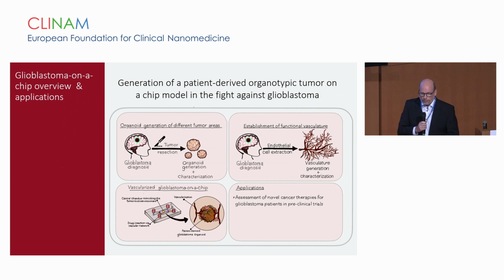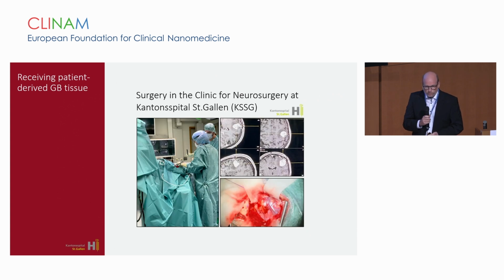So what is our aim? We want to go for this organoid generation according to the Jacobs paper. Then, and I was happy that the previous speaker highlighted how important vascularization is, our aim is to combine these organoids with the vascular system, using chip technology, which hopefully provides the appropriate mimicking environment so that we can put everything together in a novel model for exploring novel cancer therapies.